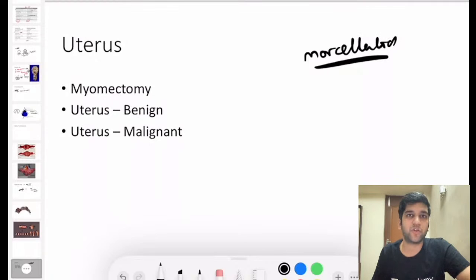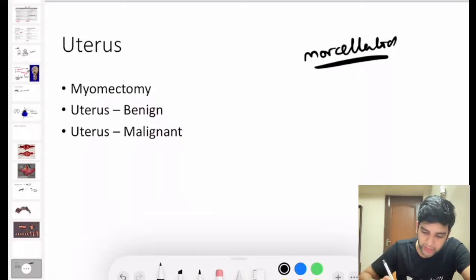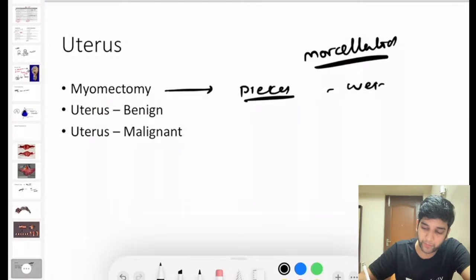It'll be long, coarse like your prostate. Same like a transurethral resection of prostate, I'll have tiny pieces, right? So the first important thing is, if you remember prostate, when I got prostate TURP chips, what do you do first? Prostate TURP chips, while grossing, we definitely do one. What is that? What do we do? We weigh. Perfect. Here also, if the myomectomy is a morcellated bits and pieces, first I need to weigh the specimen. Okay.